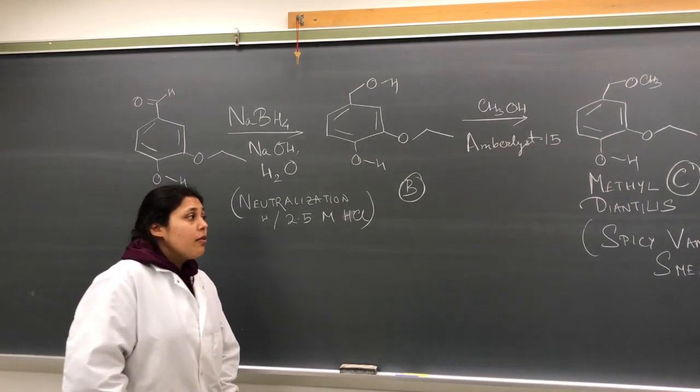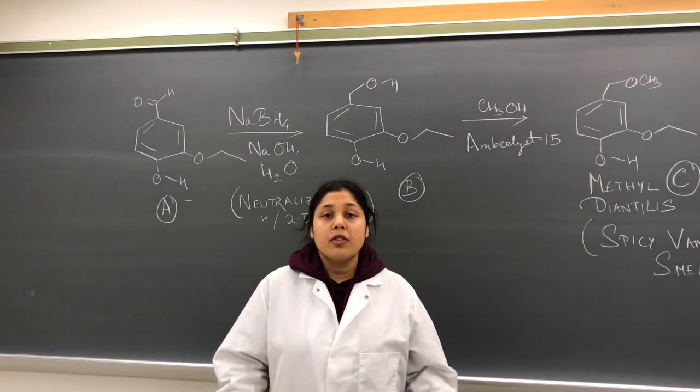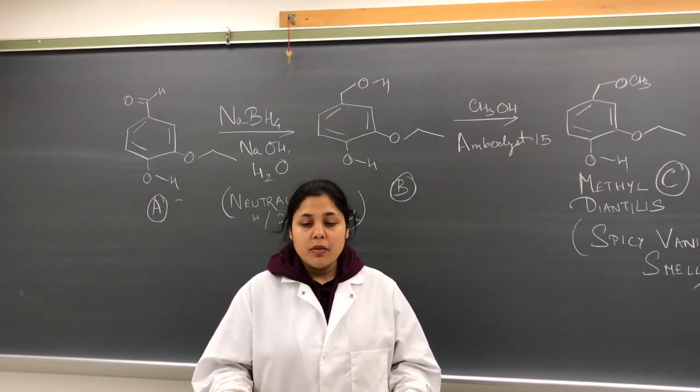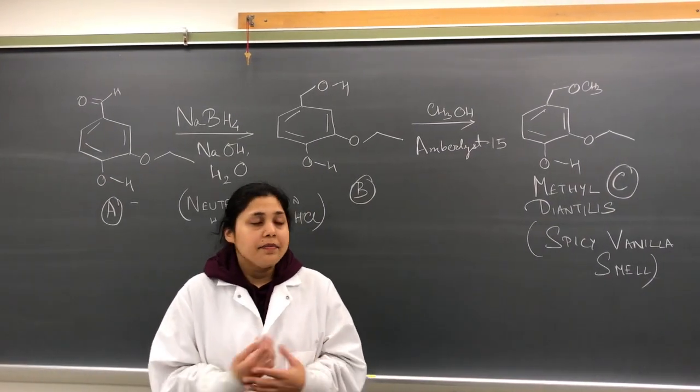So today what we're going to do is synthesize methyl diantilis. It's a 2-week experiment which we were supposed to do if you guys were here. So we are going to show you today how it's done.